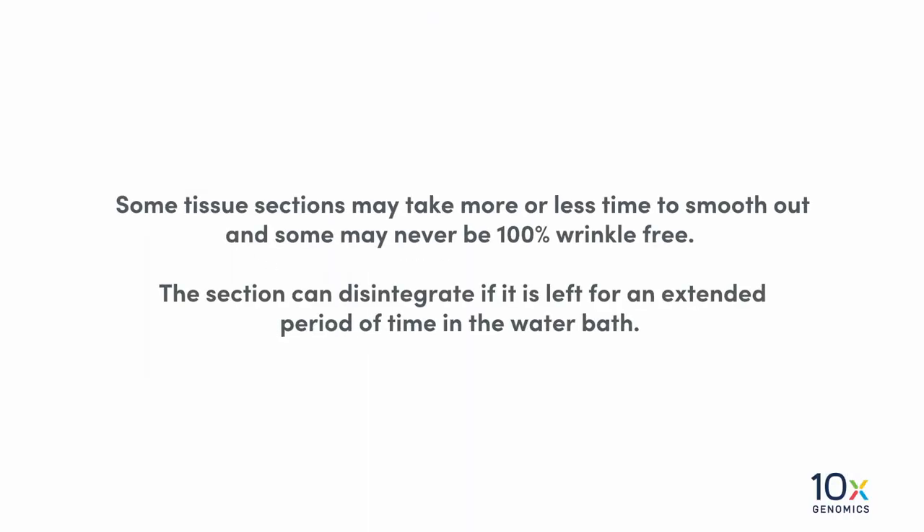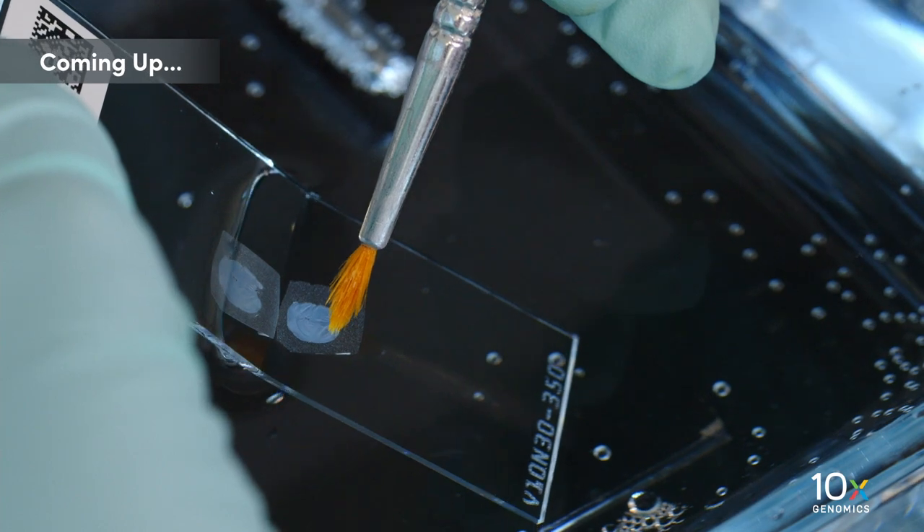Some tissue sections may take more or less time to smooth out, and some may never be 100% wrinkle free. The section can disintegrate if it is left for an extended period of time in the water bath. We have collected the tissue sections. Next, we will place the sections on Visium slides.